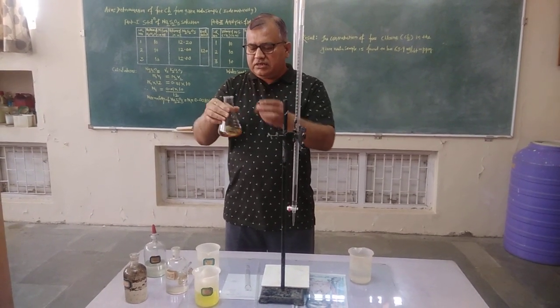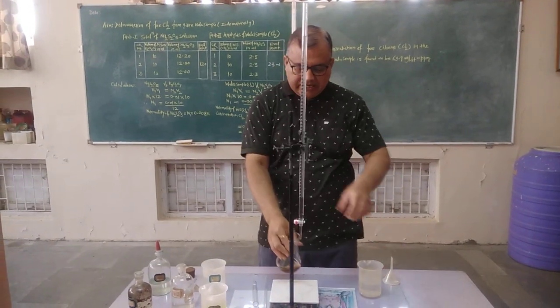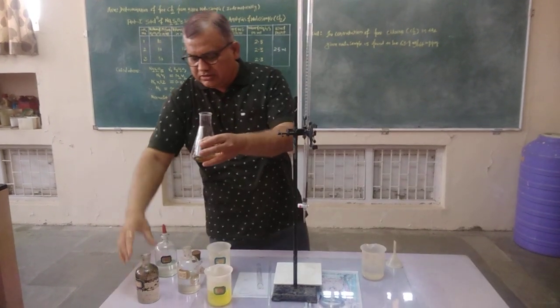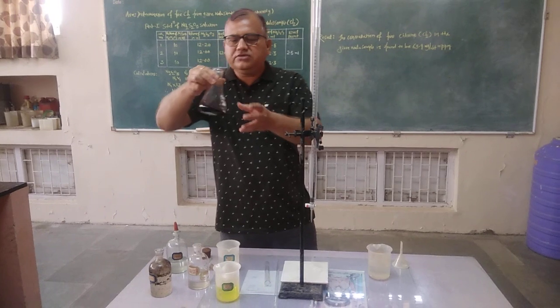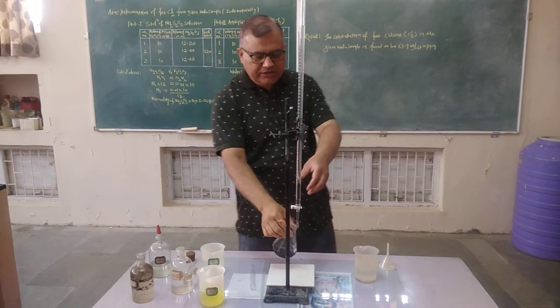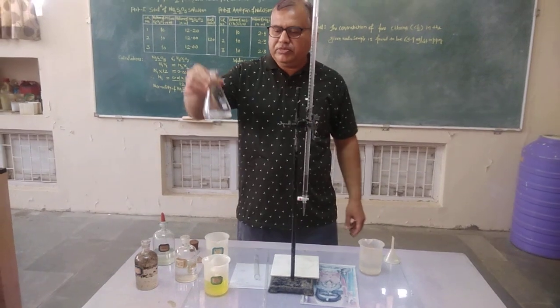So iodine is generated, and after 2-3 minutes, again you make it faint yellow by titrating against Na2S2O3, and in between you add a starch solution. After adding starch solution, you will get the I2 starch complex again, and when the concentration of I2 becomes 0, you will get the colorless solution. So you continuously titrate against this Na2S2O3 and take the sharp color change from blue to colorless.